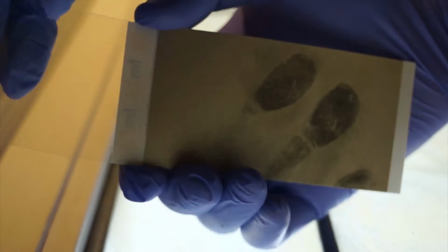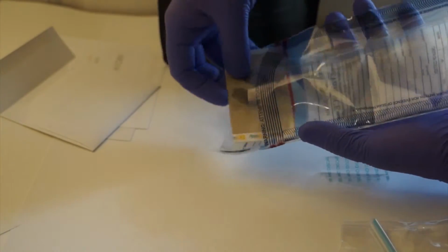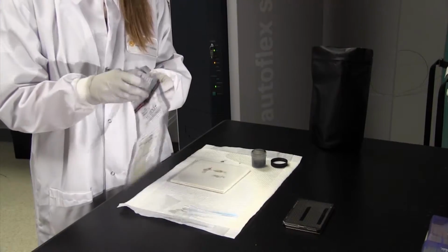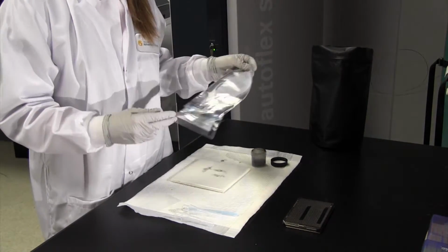Use the hinged lift to seal the print to maintain the chemical integrity and avoid contamination. Then seal in an evidence bag using your standard procedures. Fill out the included case form and mail it into the Aerogen lab in Greenville, North Carolina. When Aerogen receives the lift tapes, they will be handled using the chain of custody, just like DNA evidence.